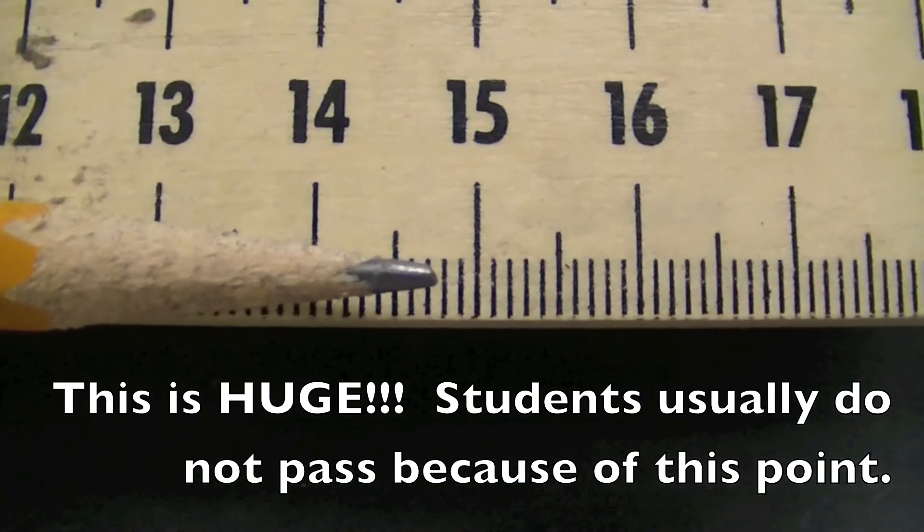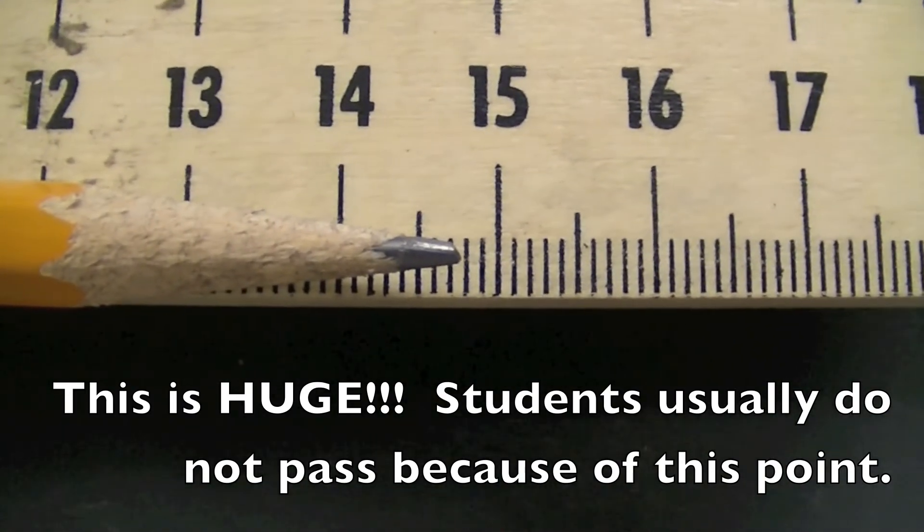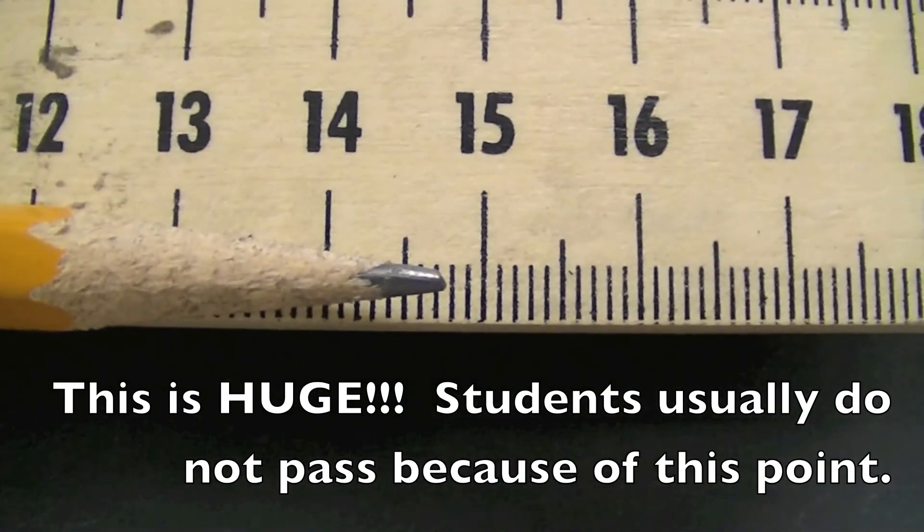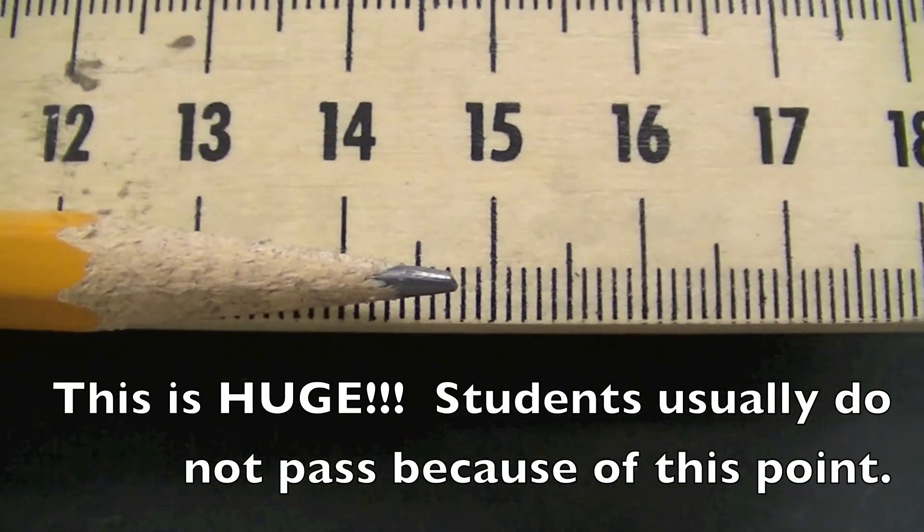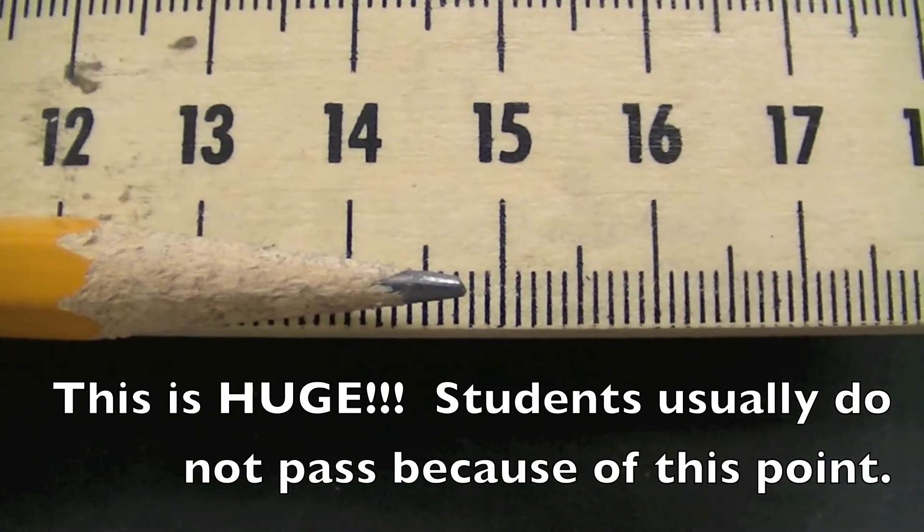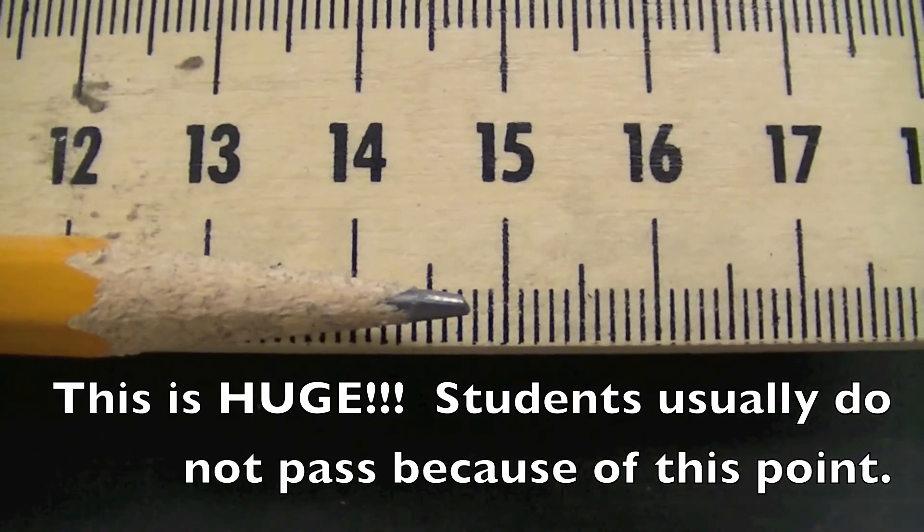So in this case, we see that 14.7 centimeters is roughly what it is. But since it only goes to millimeters, we want to go one digit past that. So we want to make it 14.78, and that increases our estimation accuracy.